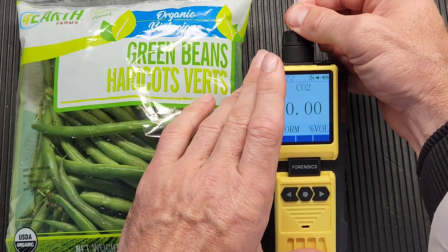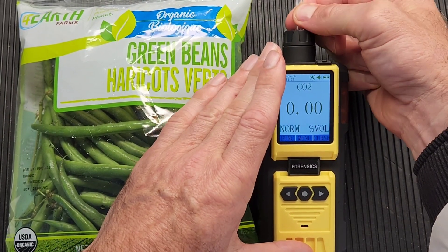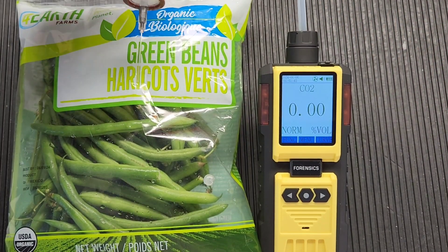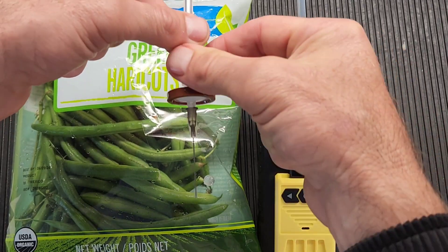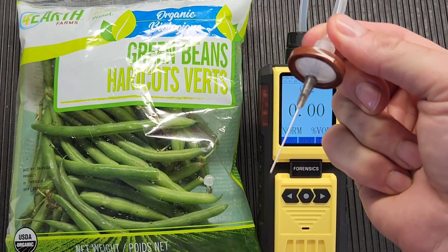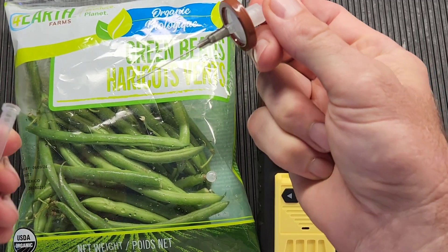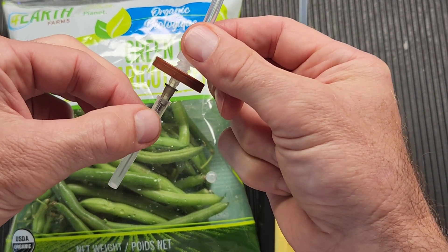It's quite easy — the tubing comes off and then comes back on via a barb fitting. At the end of the tubing, we have our filter and our needle. When the cap is off, please be very careful with the needle — I repeat, please make sure you're very careful. When you're not using it, make sure to put the cap on.